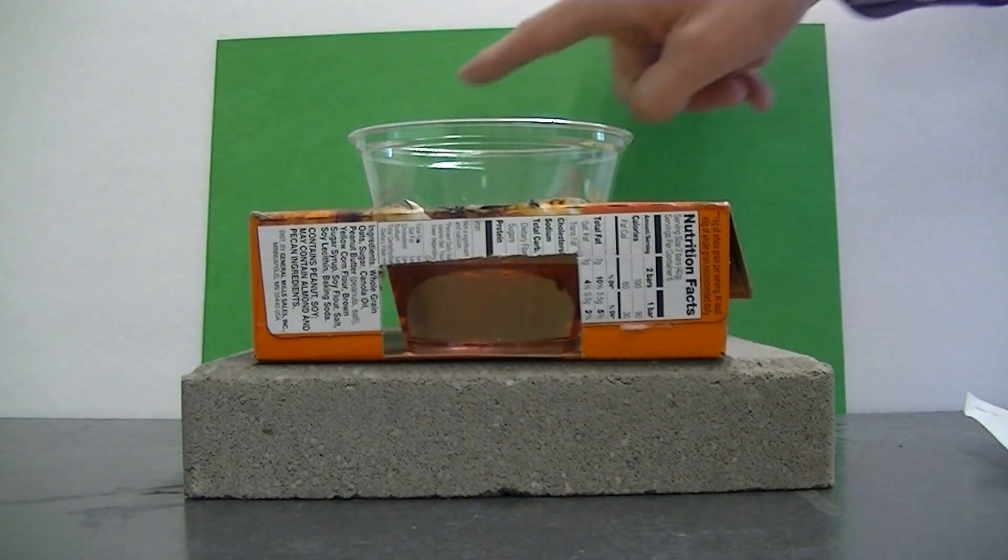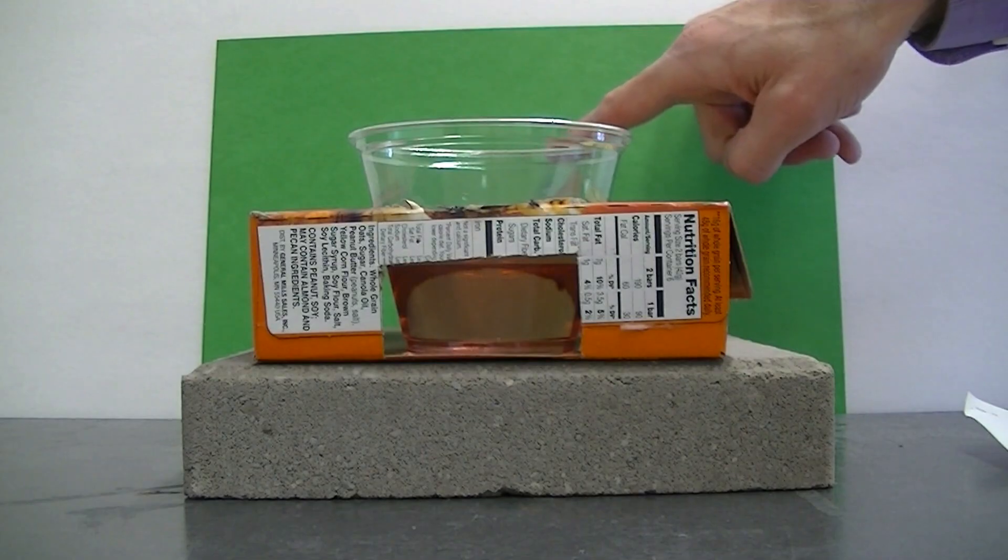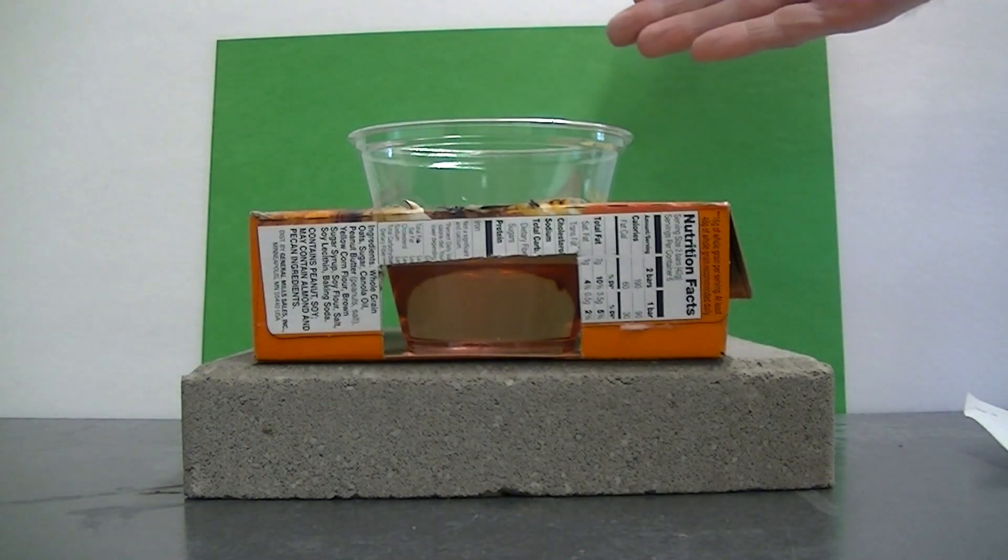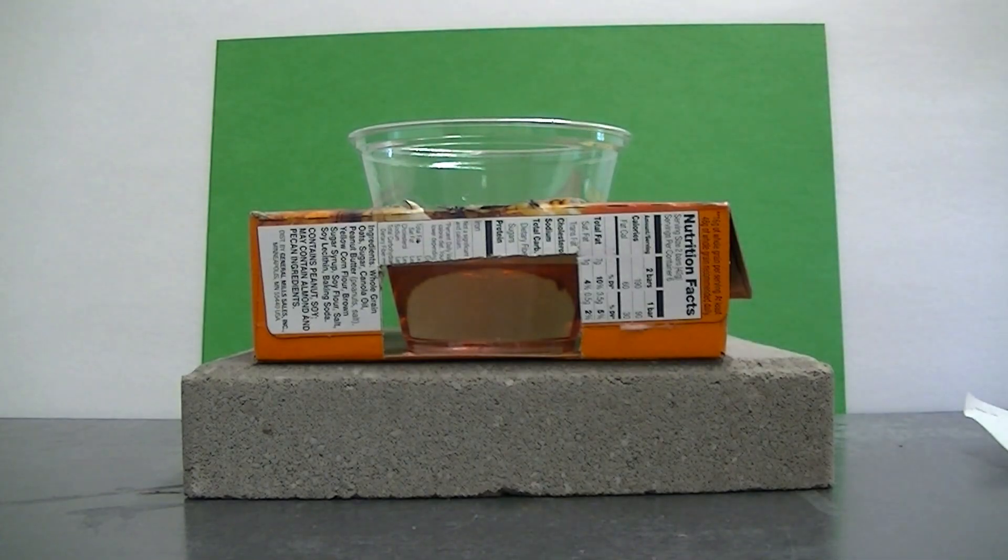The color of construction paper that you're going to use in the background should be either red, green, or blue. And the color should be chosen so that it closely matches the complementary color to the color of the solution that you'll be using. And since green is the complement to red it was very easy to choose a green background for these particular experiments.